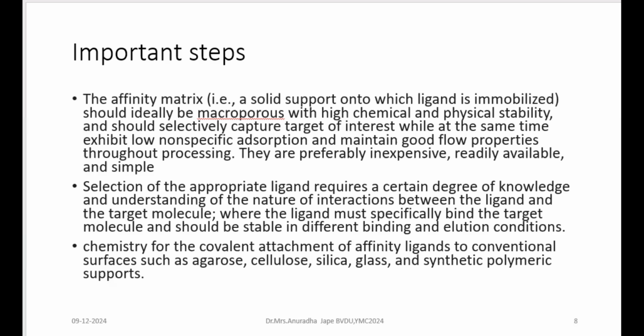So you have to take the one which is not going to have any non-specific adsorption. It should have low non-specific adsorption, and it should maintain a good flow rate. That is what I was talking about. If compression occurs, then the flow rate of the mobile phase will get affected.